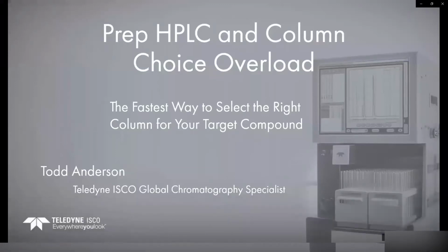We're going to try and go over some preparative HPLC column issues that people run into and how to select the best way to hit your target compounds as you would hope to.